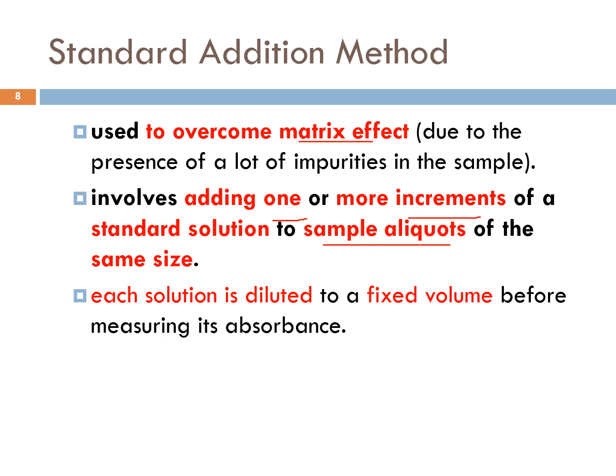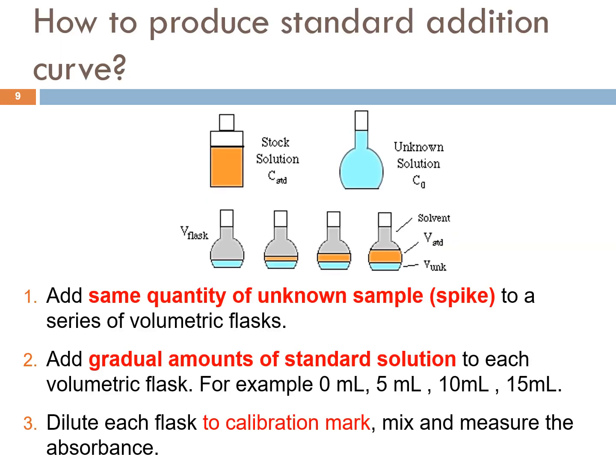Dalam tu kita letak juga sample kita. Okay, this is the way. Okay, let's say we have 4 volumetric flask. First thing first, kita masukkan unknown solution kita dulu, yang warna biru ni, the same amount of unknown solution.